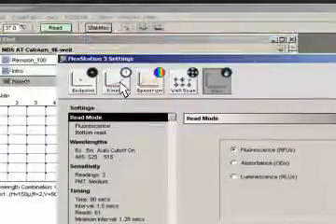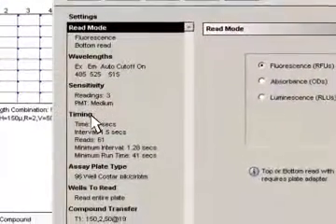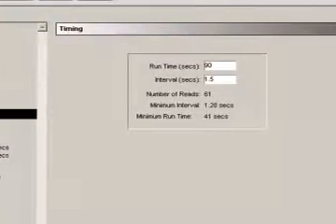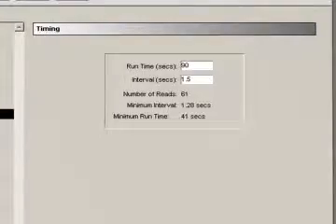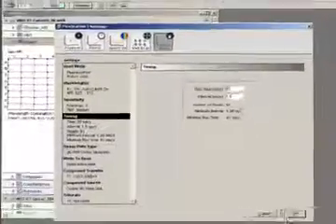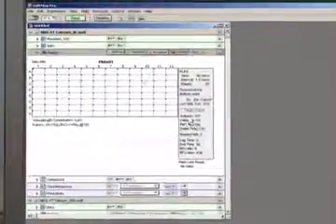In Softmax Pro software, it is easy to select the right kinetic timing for your assay. Simply enter the appropriate parameters, then click Read.